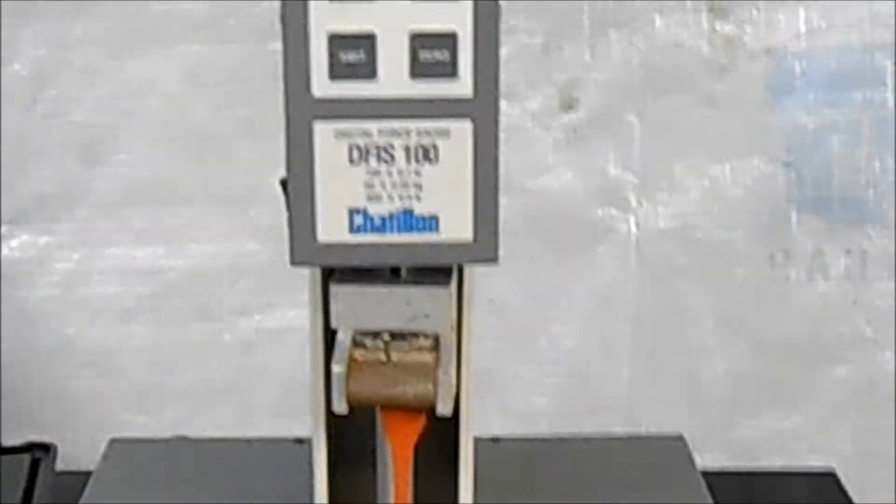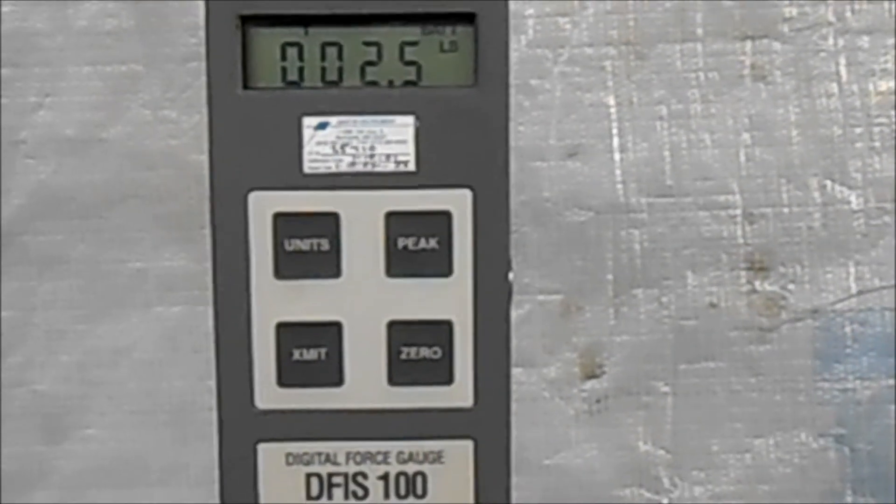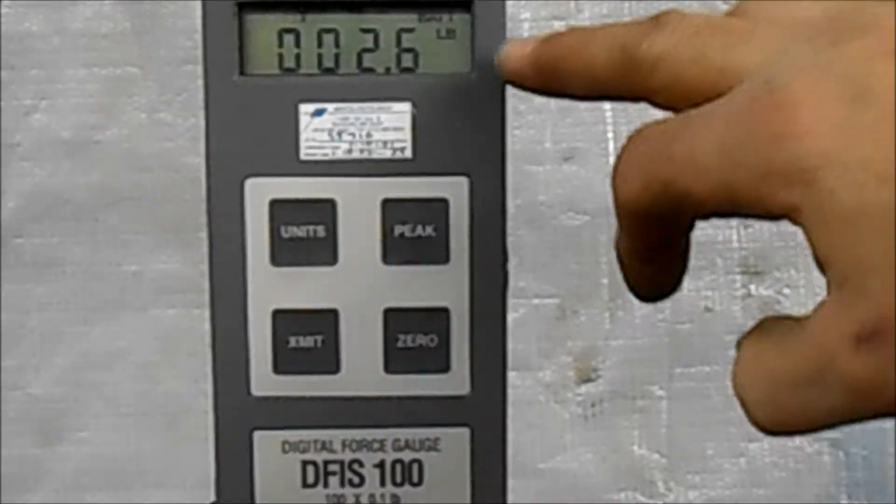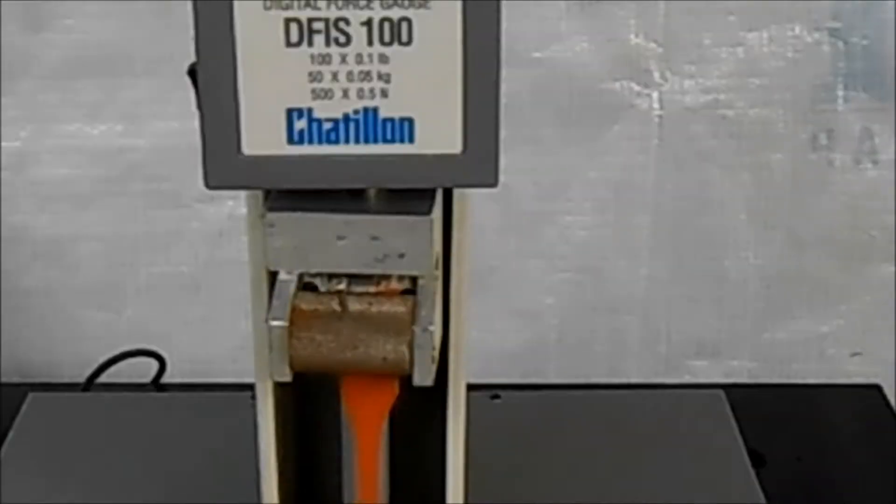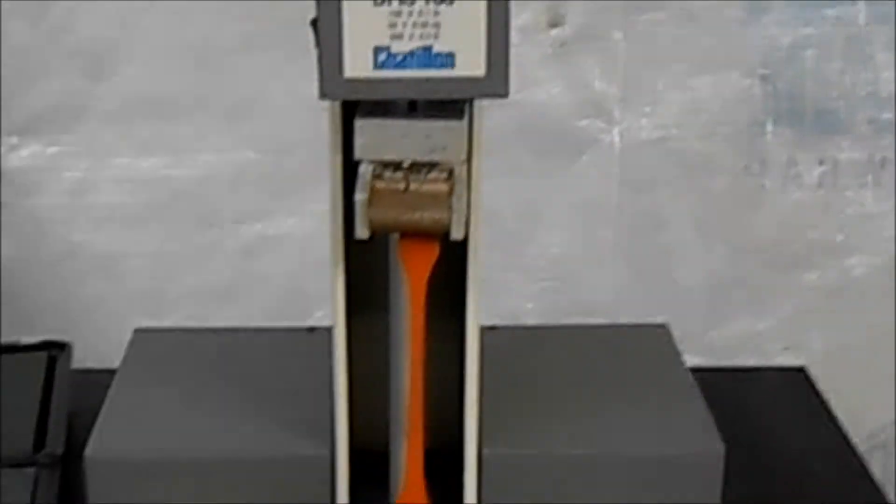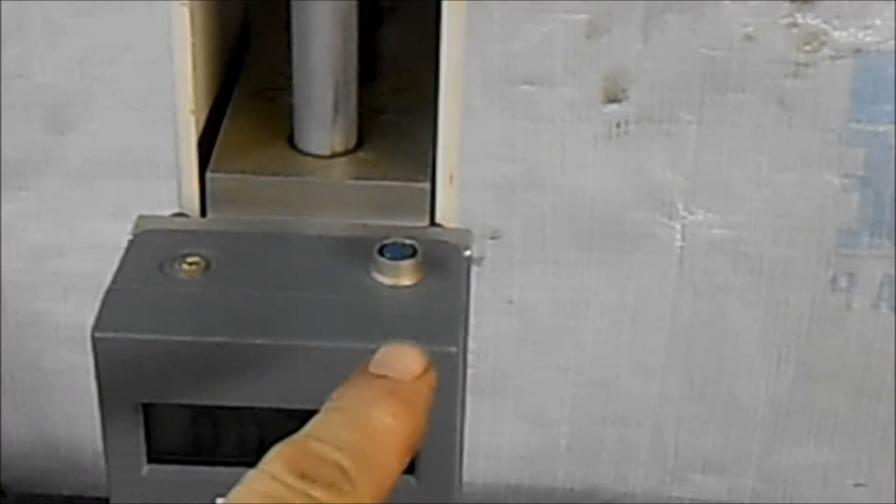And let's take a look here at the digital force gauge. The DFIS-100 is the model number. We can see that this is climbing as the sample is stretching. And this has a 12 pin connector right here that allows computer interface.